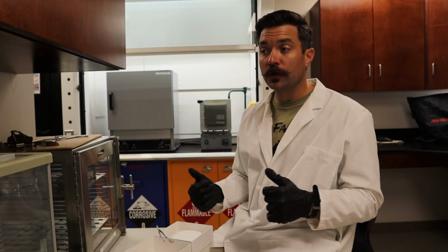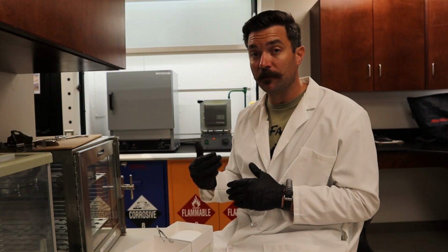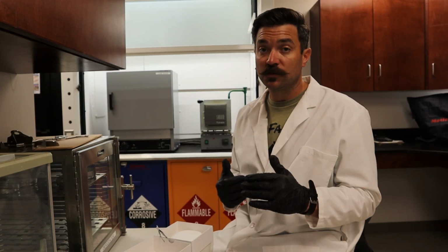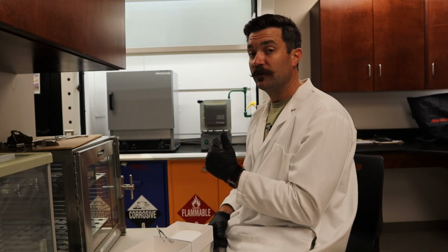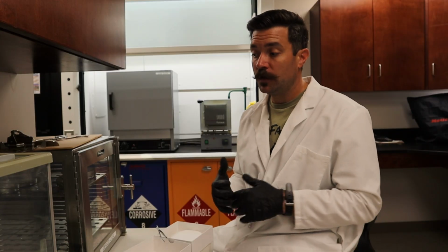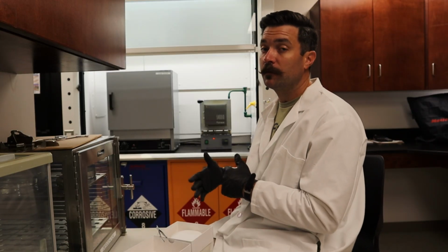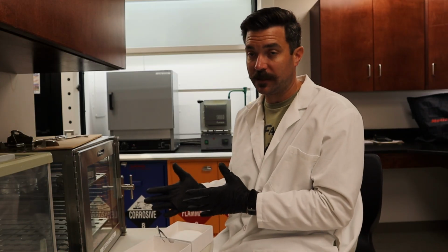You can leave it in there longer, but 15 minutes at 550 degrees Celsius in the muffle furnace, that's what you need to remember for the exam, and that's how long you have to leave it in there for it to actually do its job and cook off anything volatile. So once that 15 minutes is up, you can then remove it from the furnace, and you want to put it back in your desiccator.